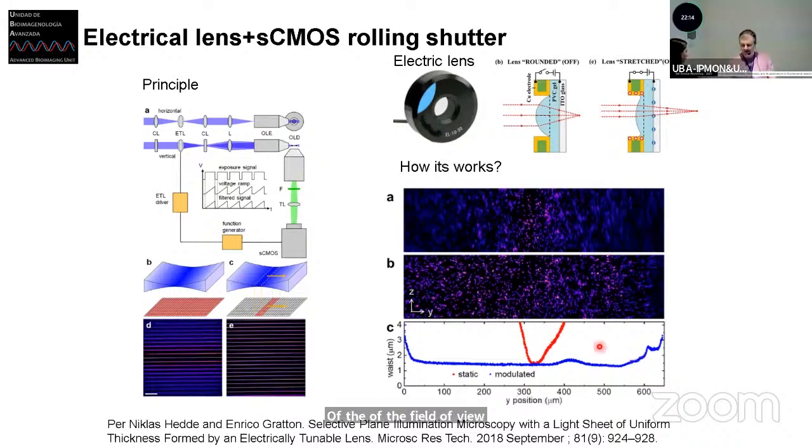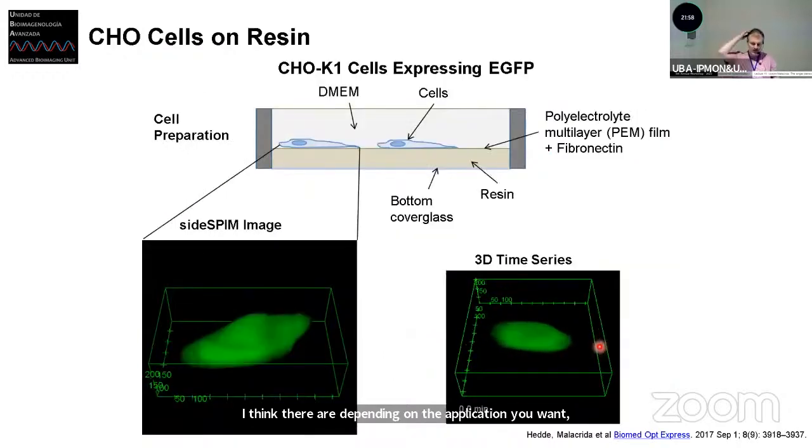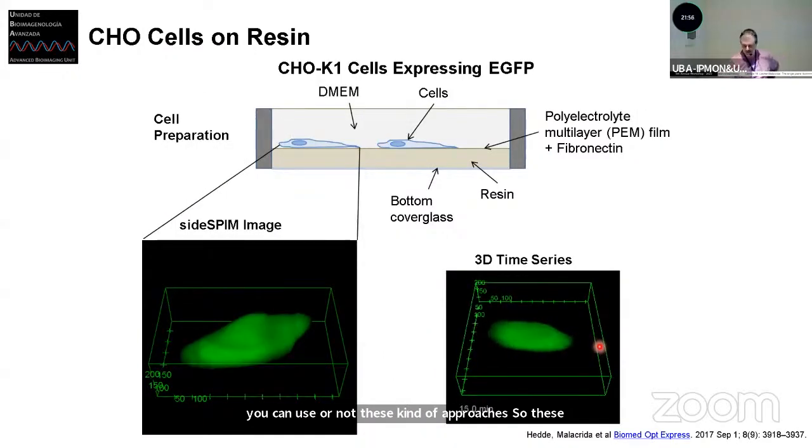There are other alternatives like Bessel beams that also give you a flat light sheet for longer. But I think, depending on the application you want, you can use or not these kinds of approaches. So these are some of the experiments I want to show you.